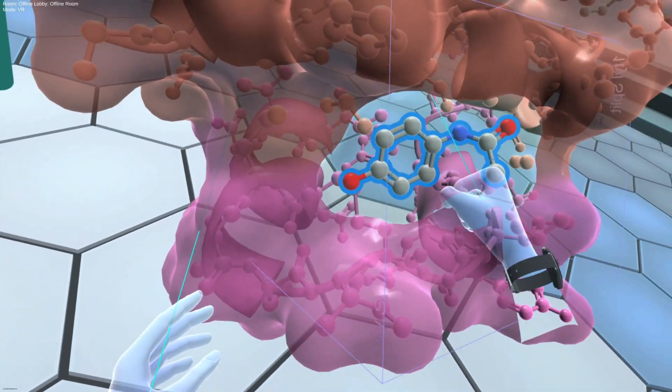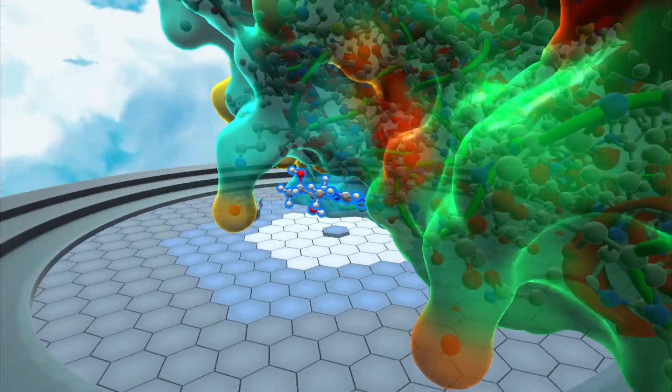Nanoscale design has never been this intuitive. Welcome to Nano.